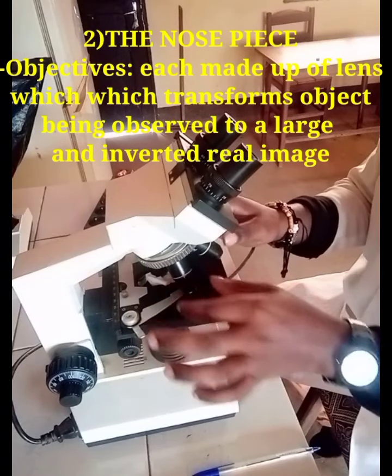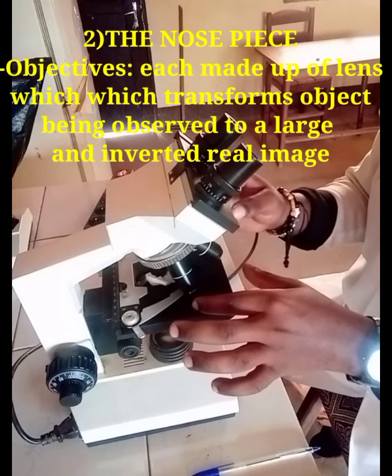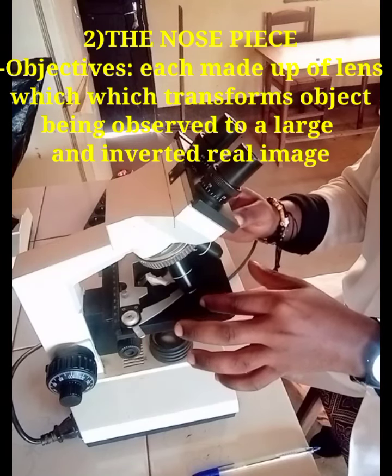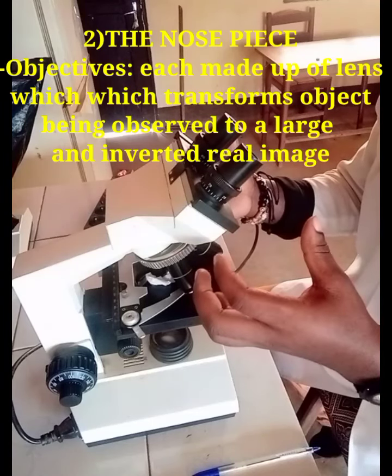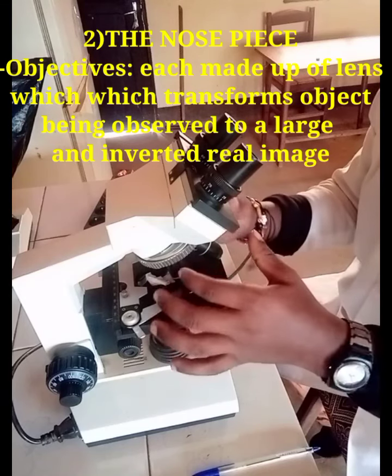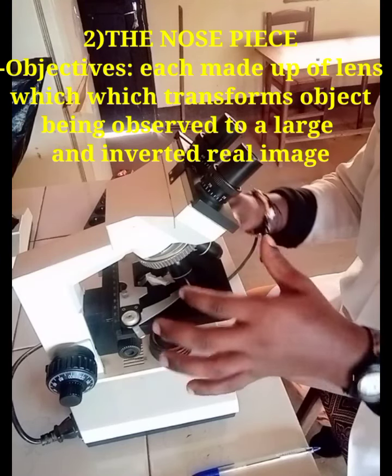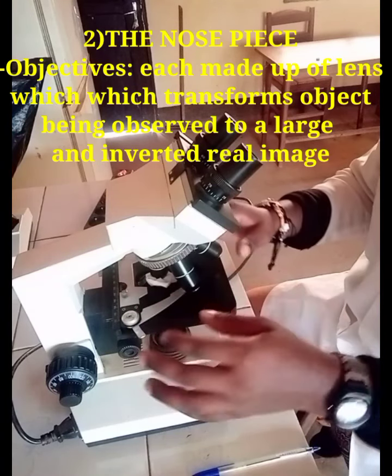These objectives help us to observe the sample on the slide at different sizes or ranges. That is their sizes, how big we want to see it. If we want to see clearer, these objectives help us enlarge the sizes.